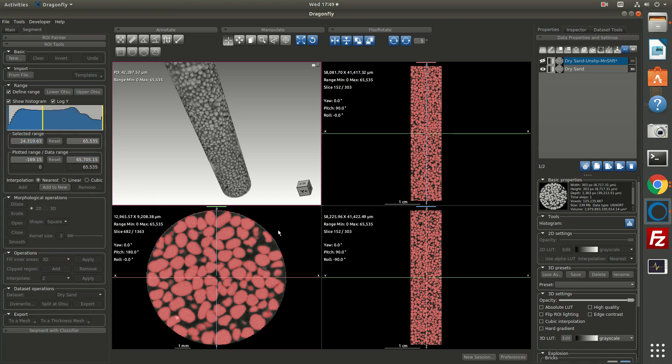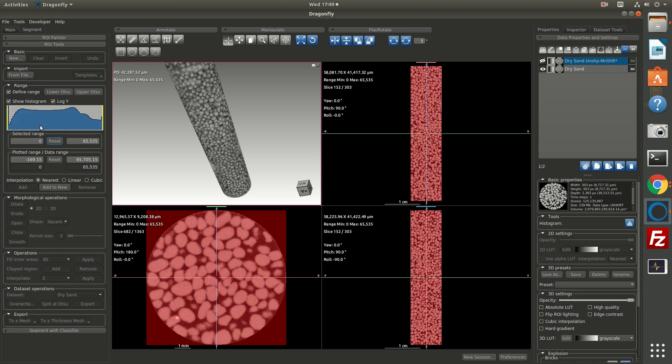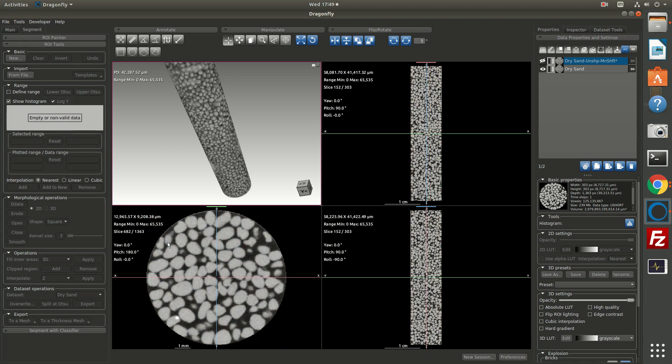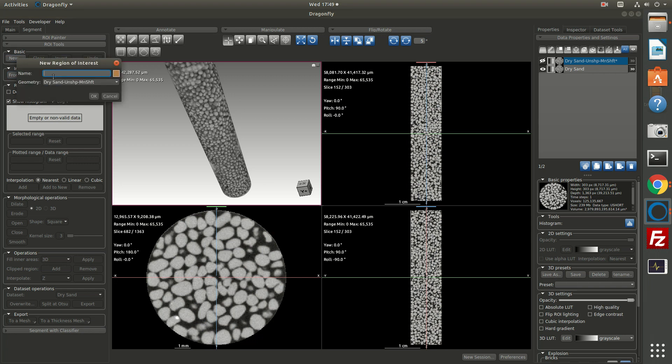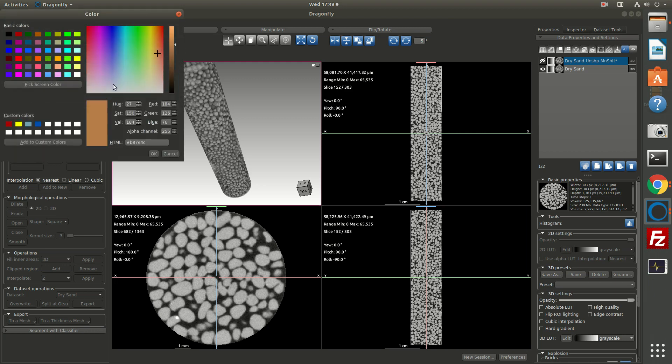Now in this case, the image also has some pixels from some core liner or maybe a Kapton tube that the sand grains were inside, so that could bias the histogram. I'm going to reset. I want to show you another way of separating based on the histogram. Now what I'll do is create a new region of interest and I'll just call this sub volume and give it a color.